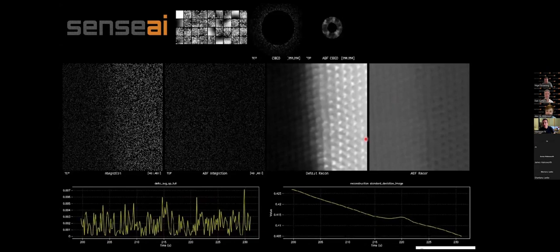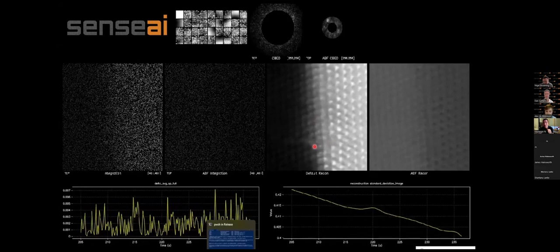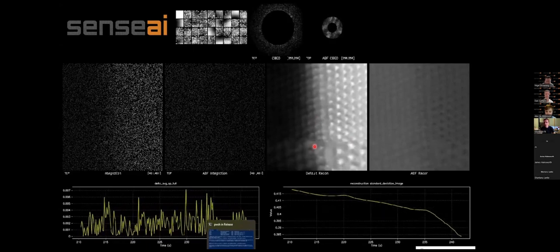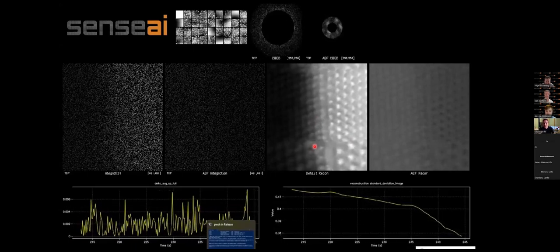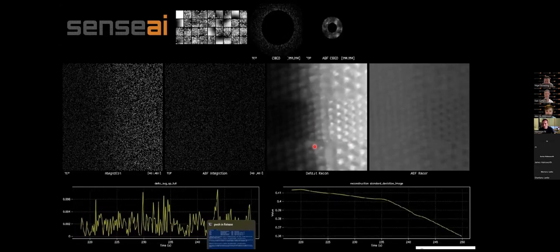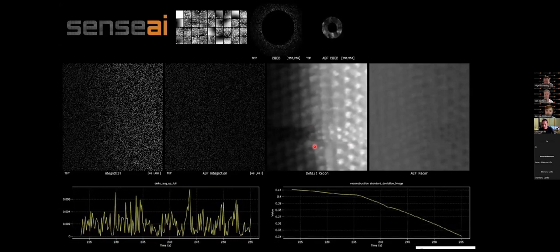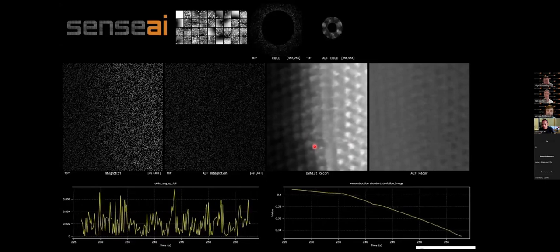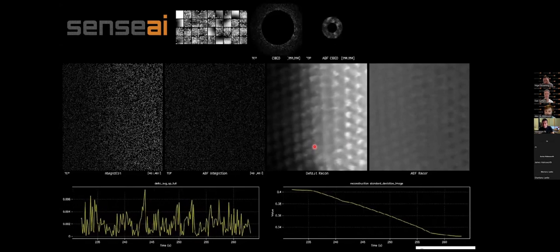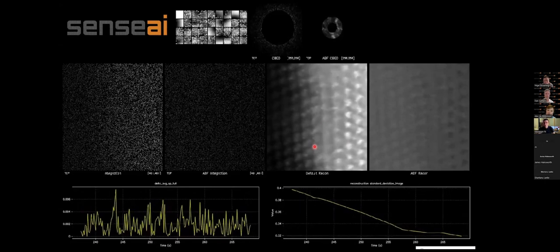As you can see, it's very stable, the interface. Yes. If we increase the subsampling, reduce the subsampling, we will start to see the atoms jumping from one interface to the other one. And so here instead we are observing a very stable interface. So this is something during 4D STEM, being able to get real-time feedback on your alignment. There's nothing worse than when you acquire a 4D STEM data set and then you're unable to know how good it is until you've gone away, analyzed it and come back. And getting that live feedback during the scan as well, rather than waiting for a scan to finish.